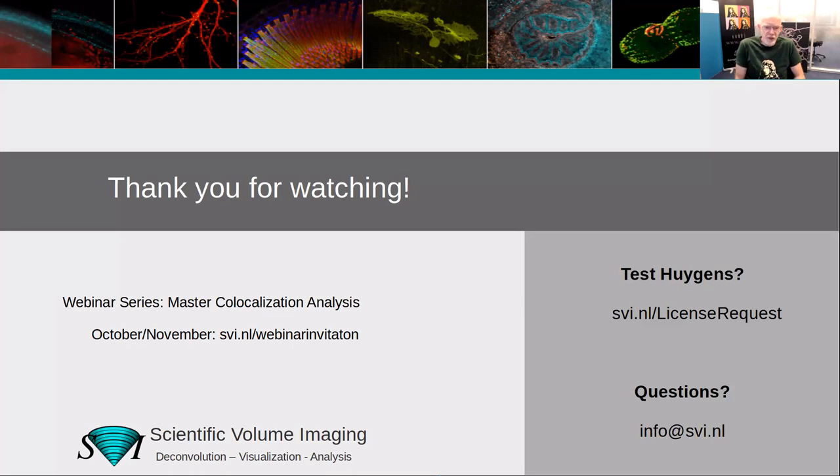Yeah, this is a constant struggle. I can explain a bit more on that, also because the developments in the file formats, also OME-Zarr, are still limited in containing the metadata that we produce or that we read from image files like STED, light sheet, and array detector data.